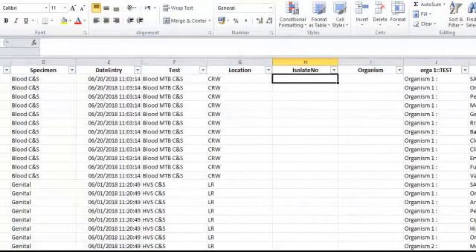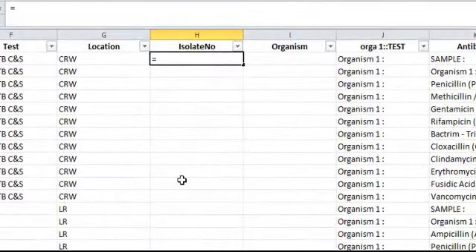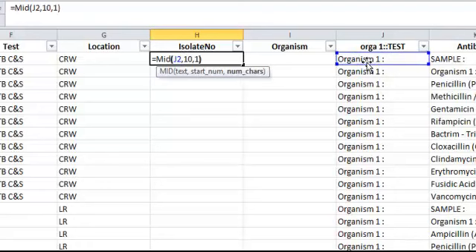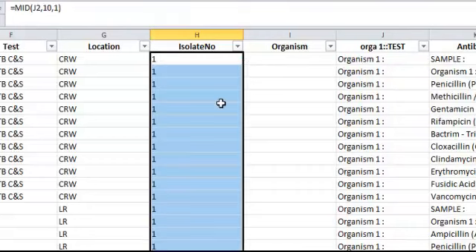the formula after this. The first formula here, I just would like to get the number, so we use the formula MID of this column at location 10, just one character there, so we get that number, and then we just copy down to the whole database.